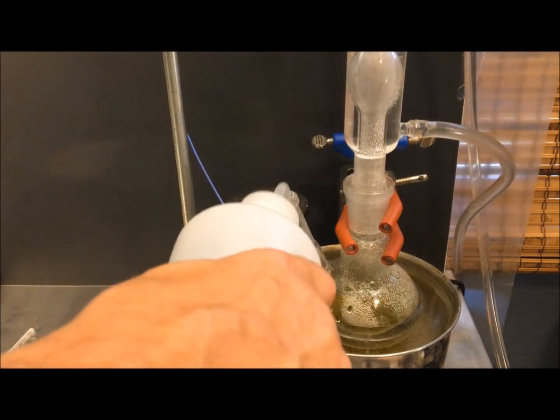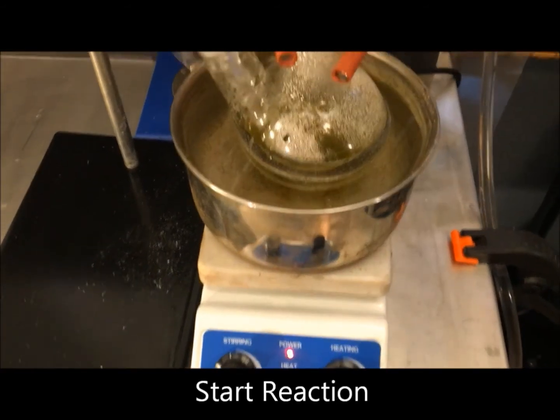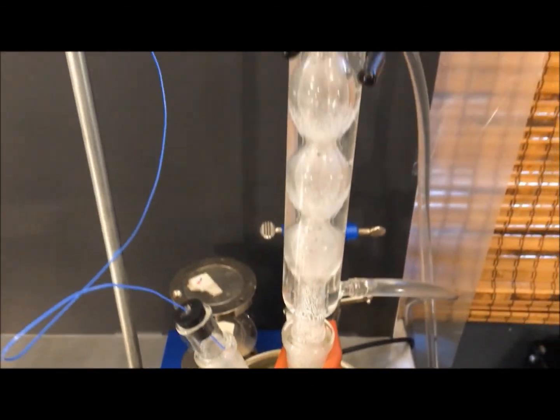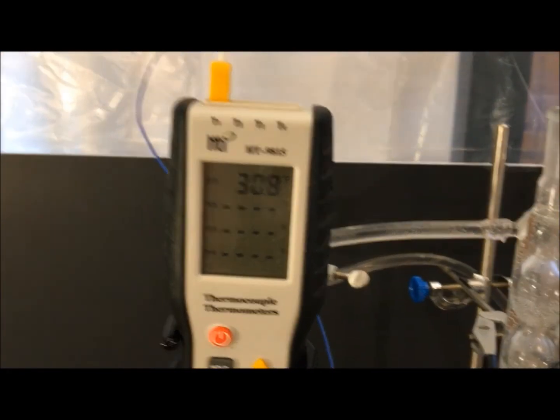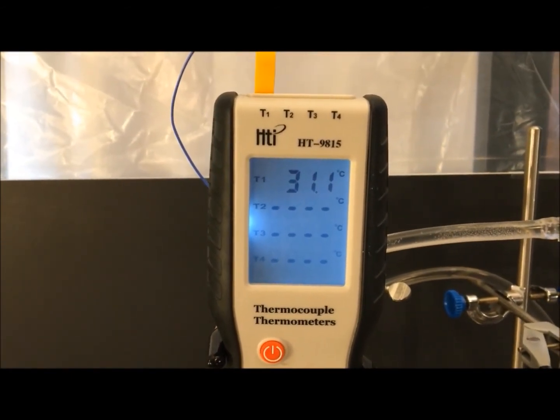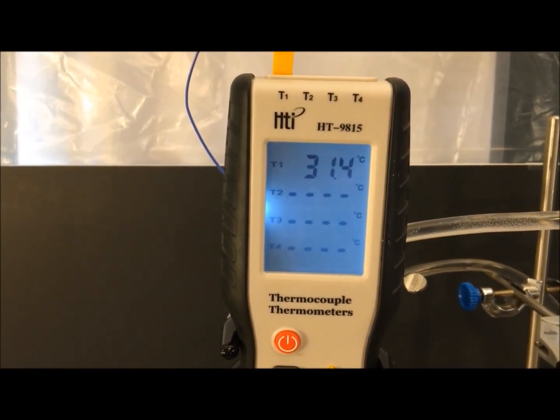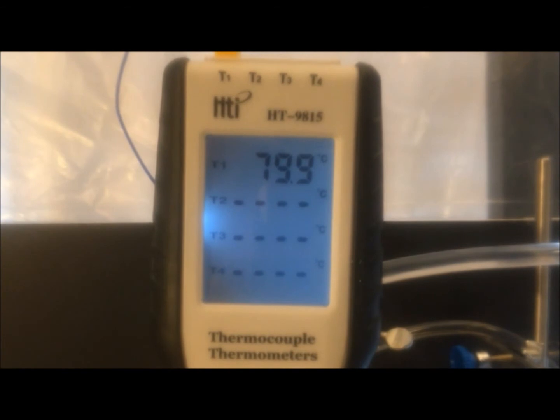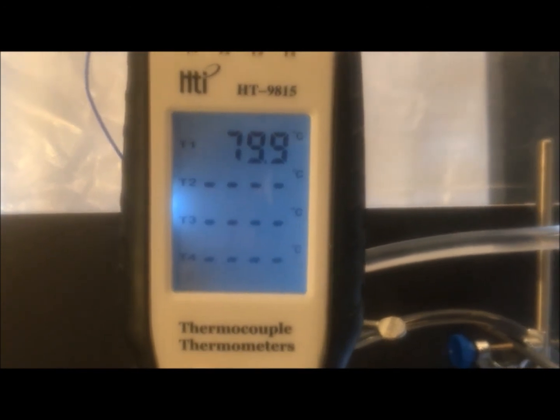Once everything's added, rinse out the neck and you're ready to start. Start the stirring and the heating. The mixture needs to be heated to 80 degrees Celsius, or centigrade if you're from that part of town. You also want to check the reflux column and make sure it's not flooding.